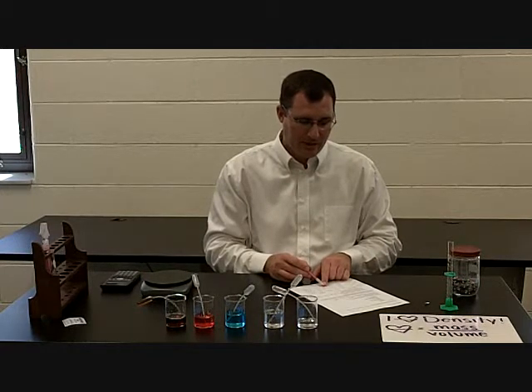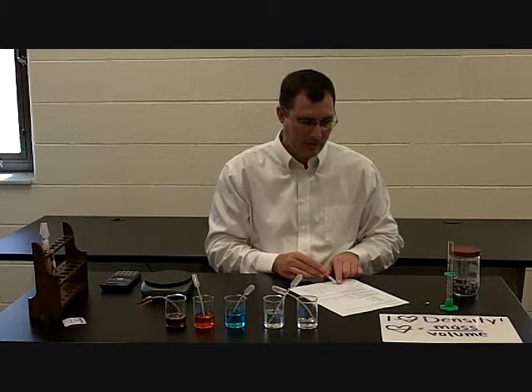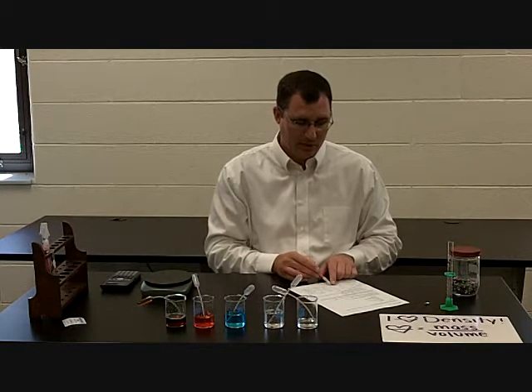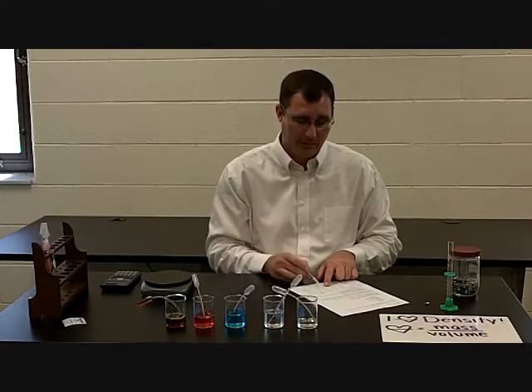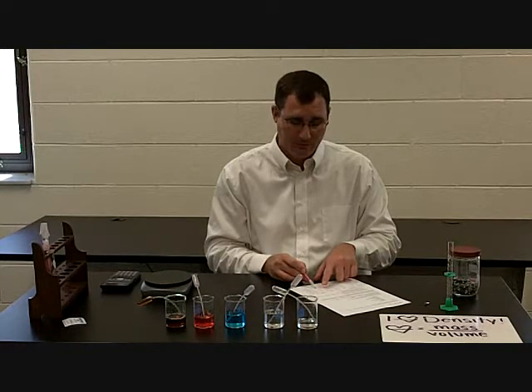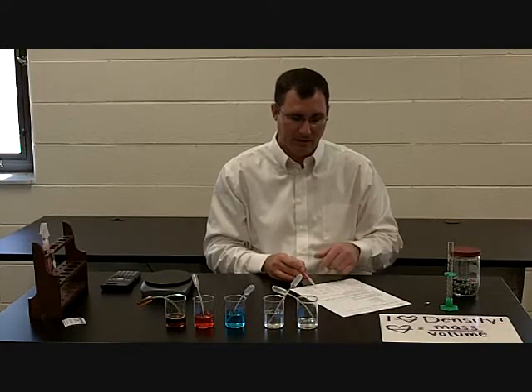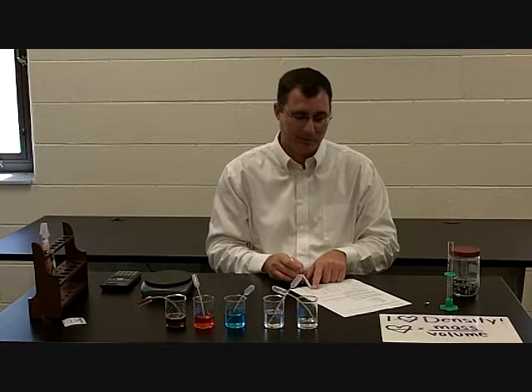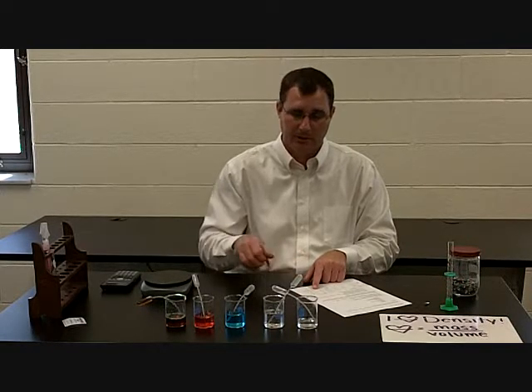I subtract the weight of the pipette, which is 0.9 grams, and that gives me 3.8 grams for the mass of the actual isopropyl alcohol that was in the pipette. I divide it by 4.8 milliliters because we know that's what the pipette holds. So it's mass divided by volume, and that gives me a density of 0.79 grams per milliliter.